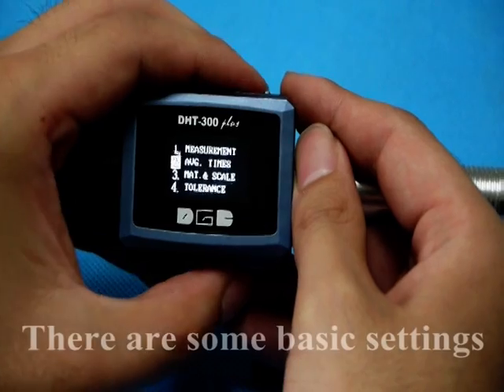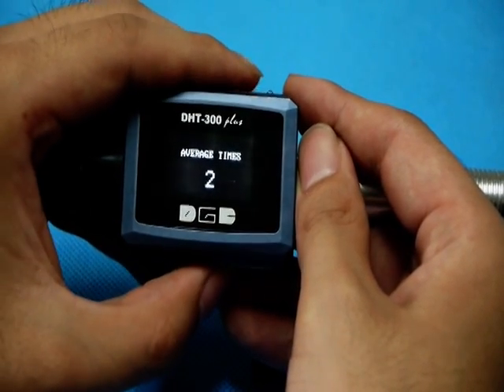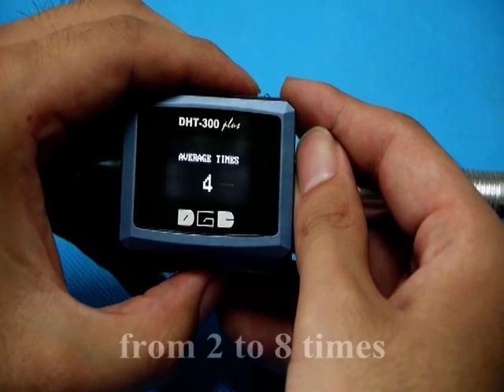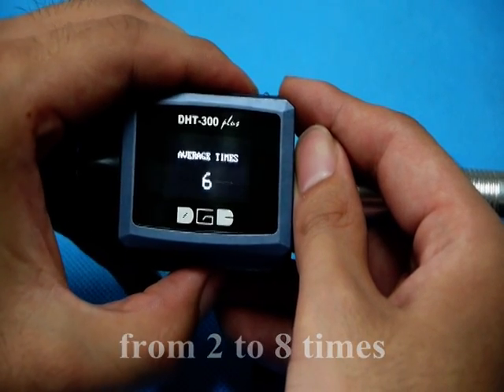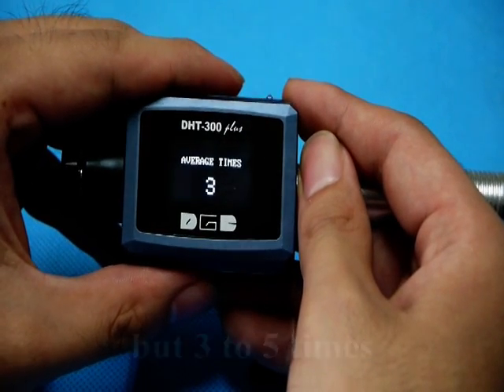Before you test, there are some basic settings. The first one is average times. You could choose from 2 to 8 times, but 3 to 5 times are recommended.